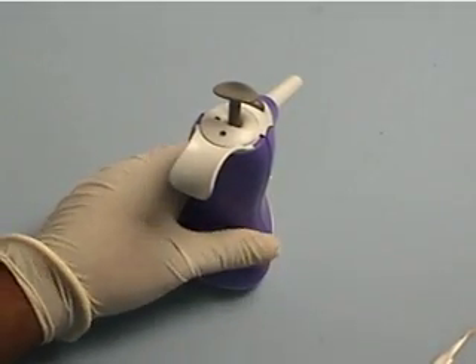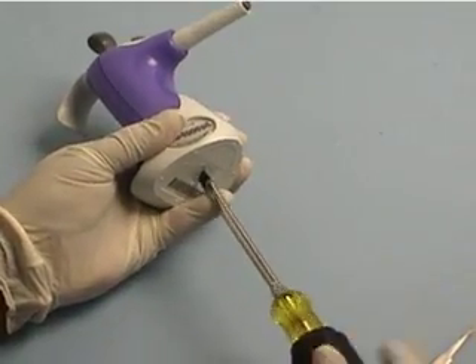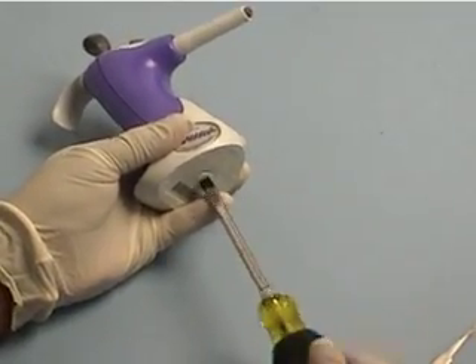To replace the battery on the Ovation adjustable pipette, loosen the screw on the base of the pipette and gently lower the base from the body.